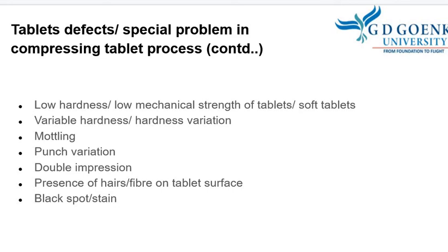Then small specks of color appear on the surface of the tablet and within the compacted mass of the tablet. So it gives an adulterated or spurious drug feeling. Mottling can be overcome by compacting with desired excipients, or the tablet can be film coated.